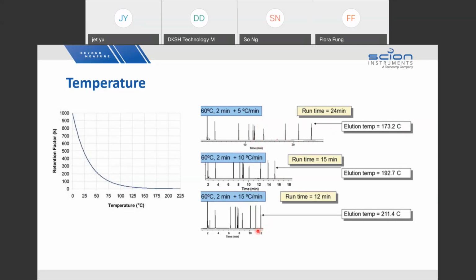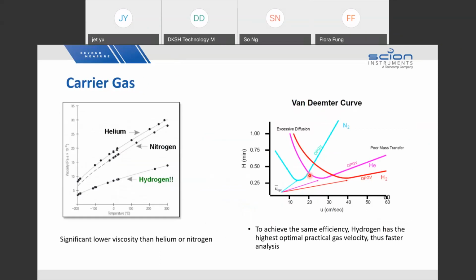But rather than you start from the beginning, this is very risky. If you change from the very beginning, this is going to affect the entire chromatogram, the elution order and the resolutions as well. So it's more like struggling for you.